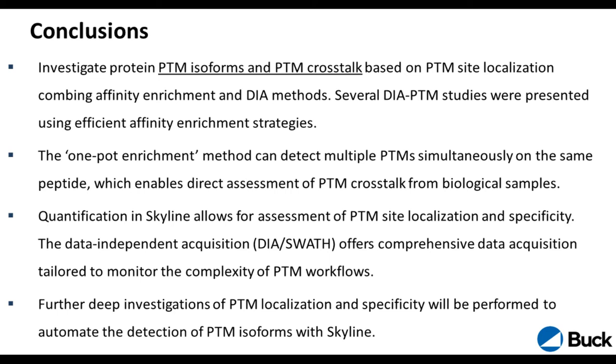This is my last slide, kind of summarizing the data. So we have really become interested to look at PTM isoforms and crosstalk. We use this one-pot enrichment in order to cover more than just one modification at the time. And we often now use DIA SWATH workflows in combination with quantification in Skyline, an open source software, to get the most out of our quantification data, and also to be able to easily visually access the data that we acquire from the instruments.